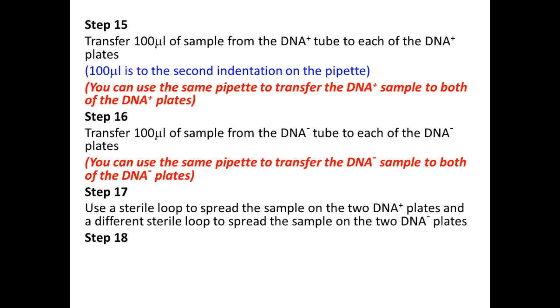And this is just to spread them out, right? Spread out that media, the bacteria on that plate. And the same holds true. You can use the same loop for your plus plates and a different loop for your minus plates, right? So you should only need to use 2 loops. Does that make sense to everybody?